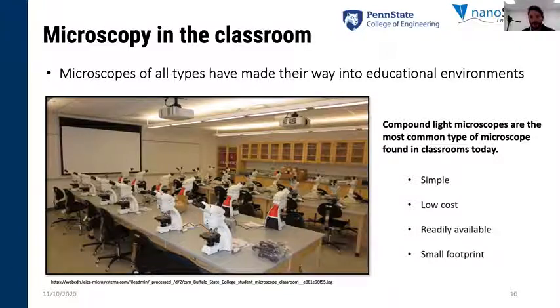Now, a lot of the reasons that compound light microscopes are so common wouldn't be a concern if you were to use a microscope remotely, right? Small footprint is no longer a big deal if you're using the instrument remotely. The microscope could take up an entire room. Who cares if you're using it from home? Low cost as well. They're low cost because you need 20 of them. If you only need one and 20 different students can use it remotely, it doesn't necessarily need to be as low of a cost.